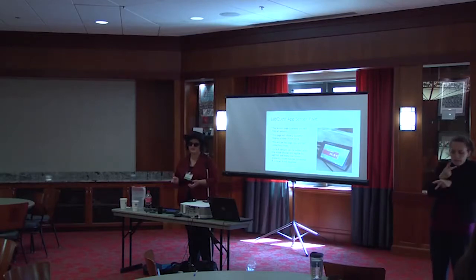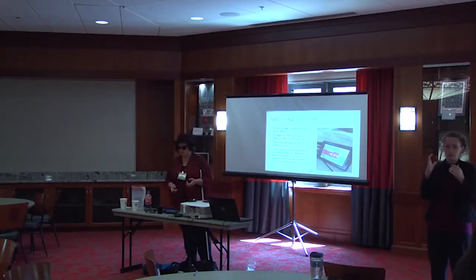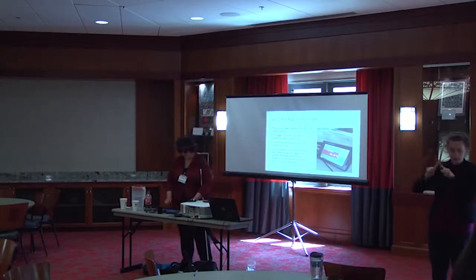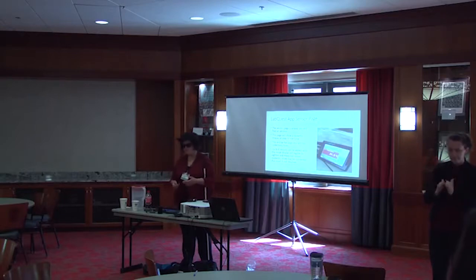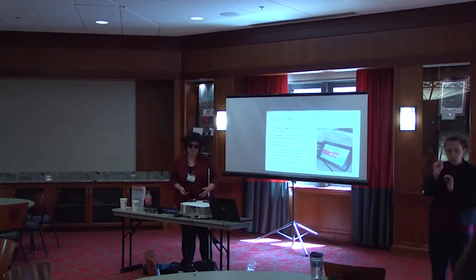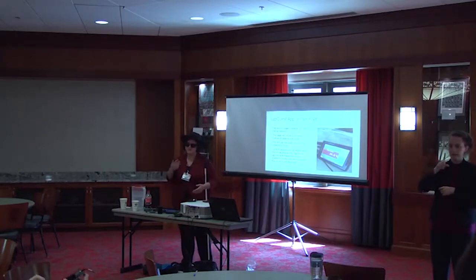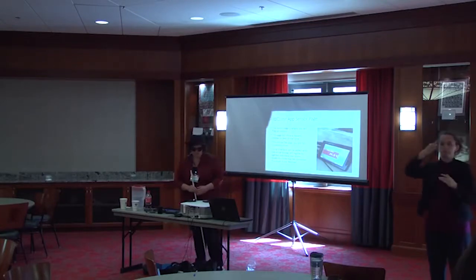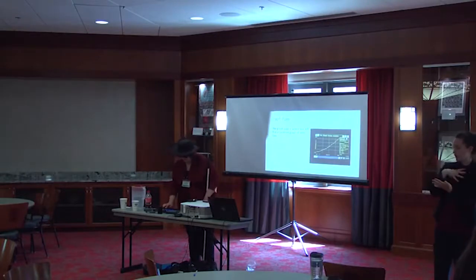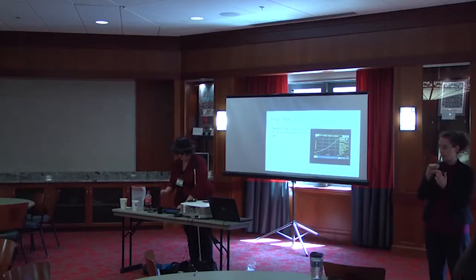Graph page. Push button. Run selector. So then if you also, maybe you have a graph and you want an audio representation of the graph, then we also have sonification of the graph and the graph that we recorded earlier. So if you listen closely, you'll hear a small popping noise, and that will play at every 25, 50, 75% to give you an idea of where in the graph something happened.